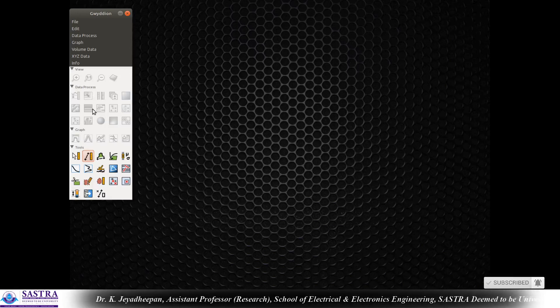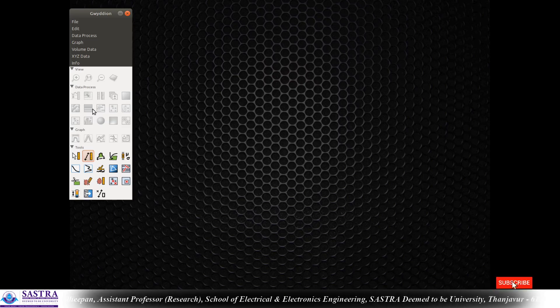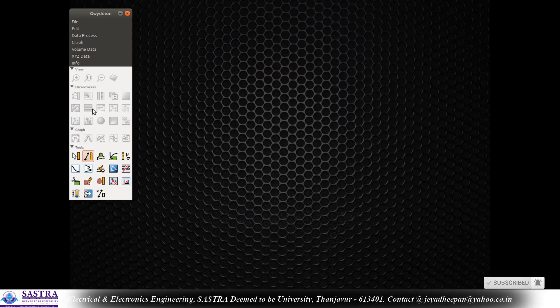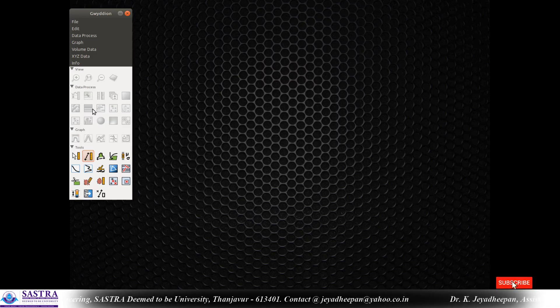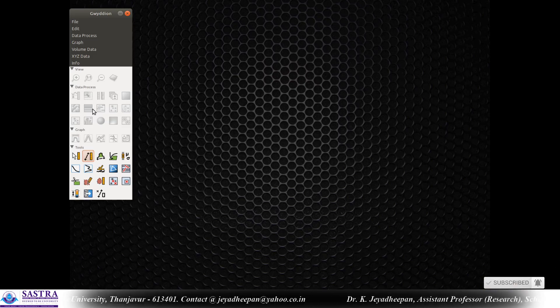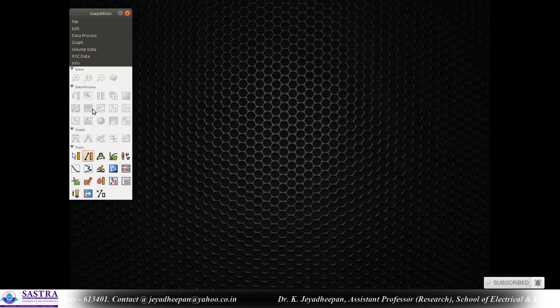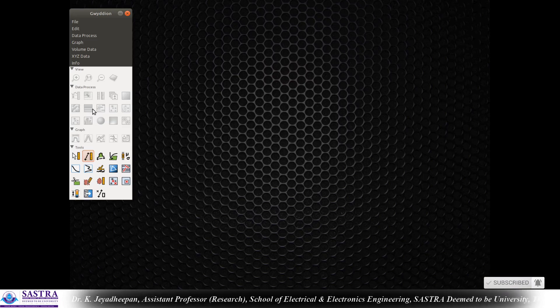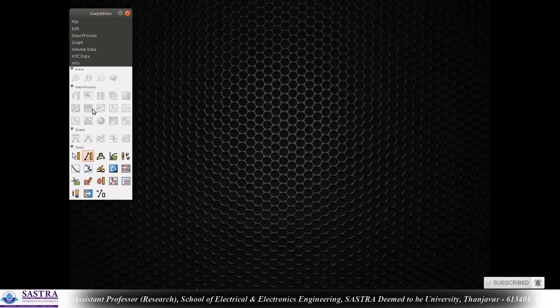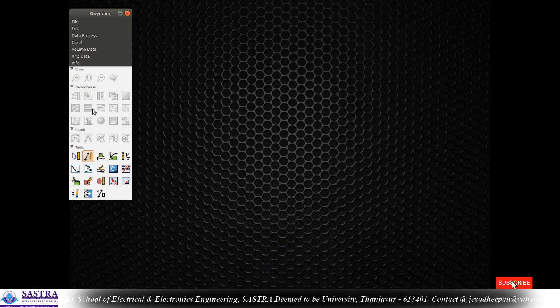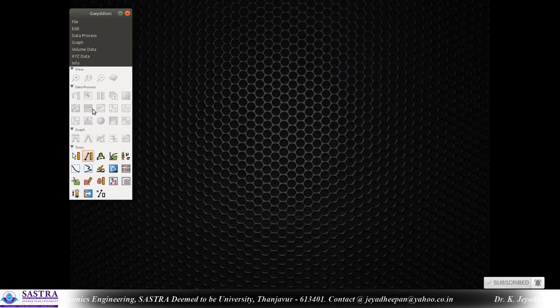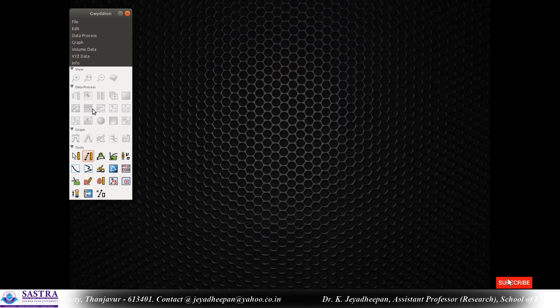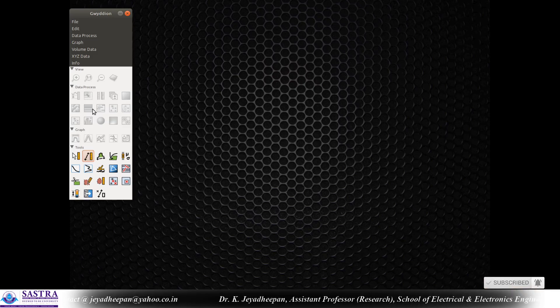Hello students and friends. In this video we are going to see a demo on AFM analysis using the software called Gwyddion, which is open-ware to analyze SPM images. In this demo we are going to analyze the AFM image — how you can process the data, how you can get the three-dimensional view, and what statistical parameters you can get out of it.